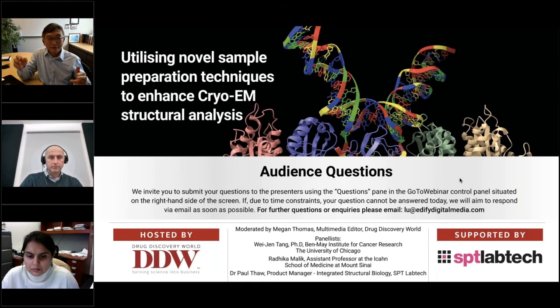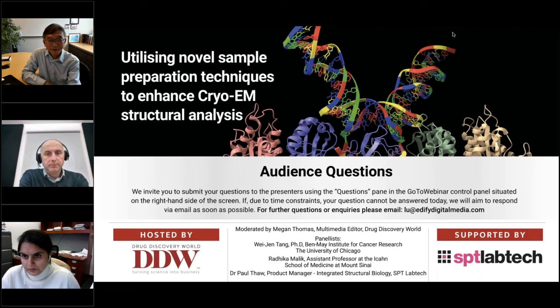In other words, when you do the mixing, we need to start with 5 mg per ml. Then because you're mixing with a substrate, it drops down to around 2 to 2.5. That's where we can get our sample to behave well enough. So I do not remember a huge discrepancy. I assume it's protein dependent, and that's what I remember.